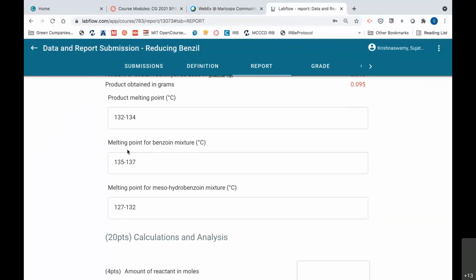I think you're talking about this. It's not going any higher. I mean, it's slightly off. Instead of 132, it's coming at 135, but that's just maybe a technique issue. So are you convinced, Roger? Let me know. Because it's not really higher. I think it's still a very sharp range. This is not very sharp. This really drops.